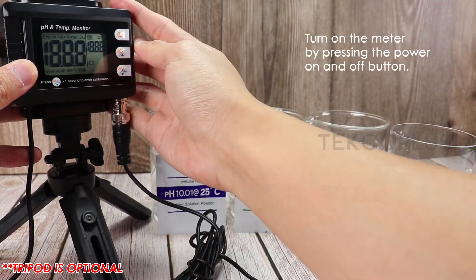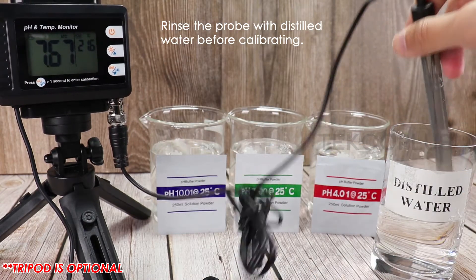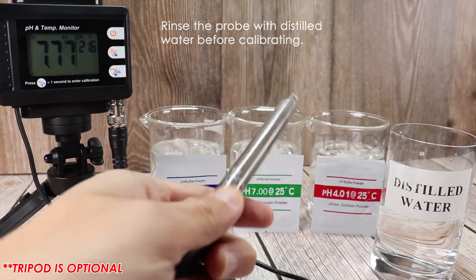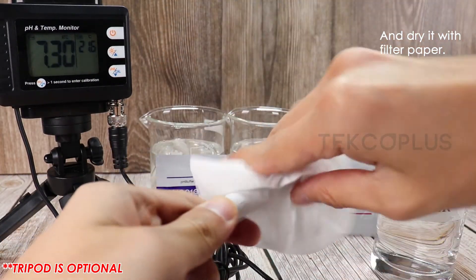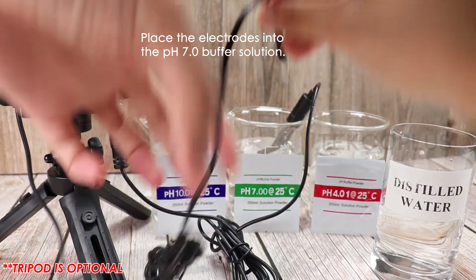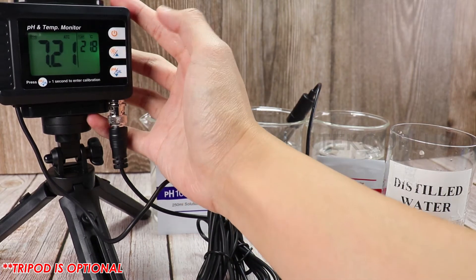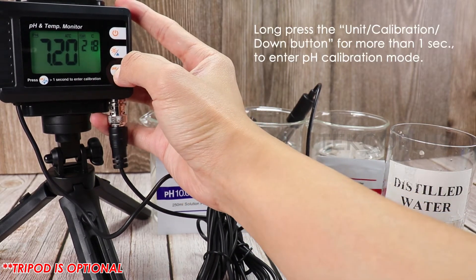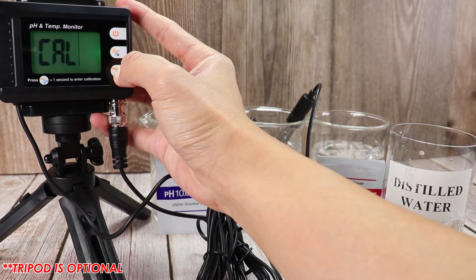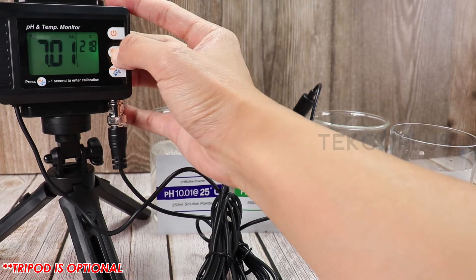Turn on the meter. Rinse the probe with distilled water before calibrating, and dry it with filter paper. Place the electrodes into the pH 7.0 buffer solution. Long press the calibration button to enter pH calibration mode. The icon CAL will appear and pH value 7.0 will be displayed on the LCD.